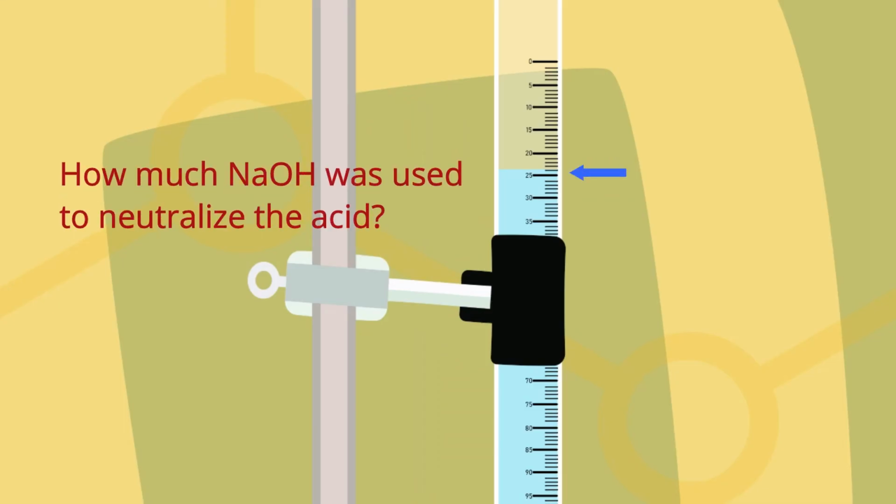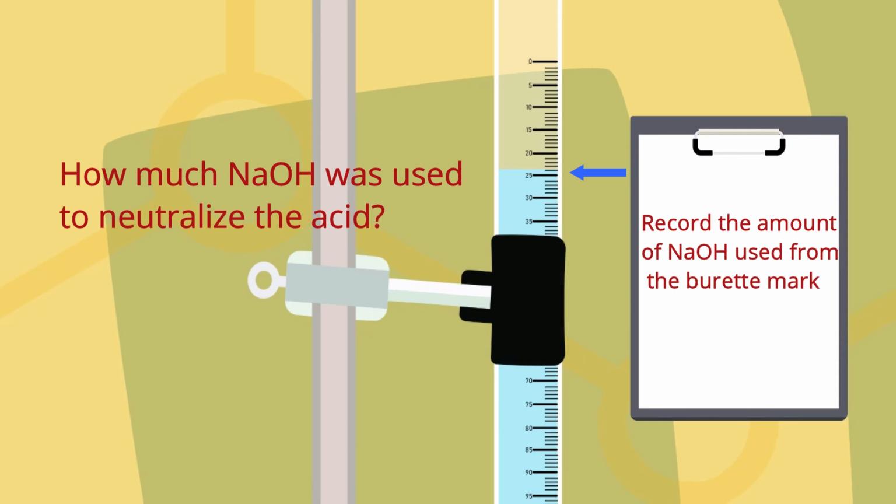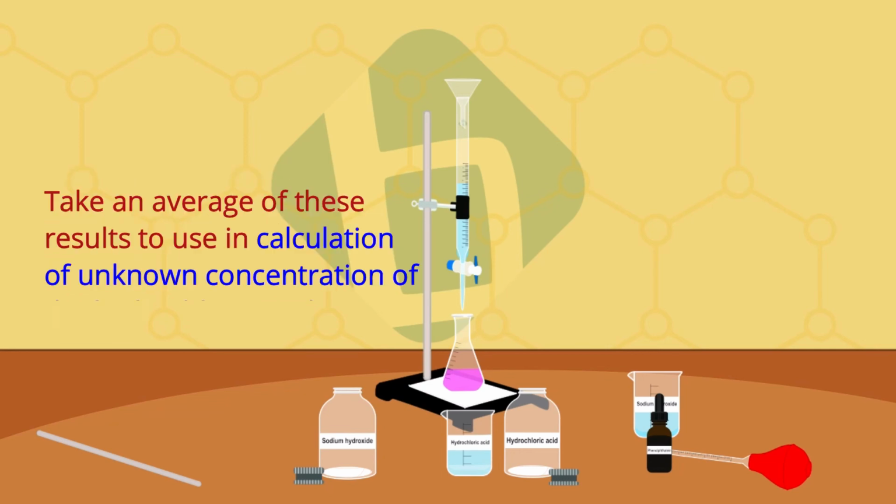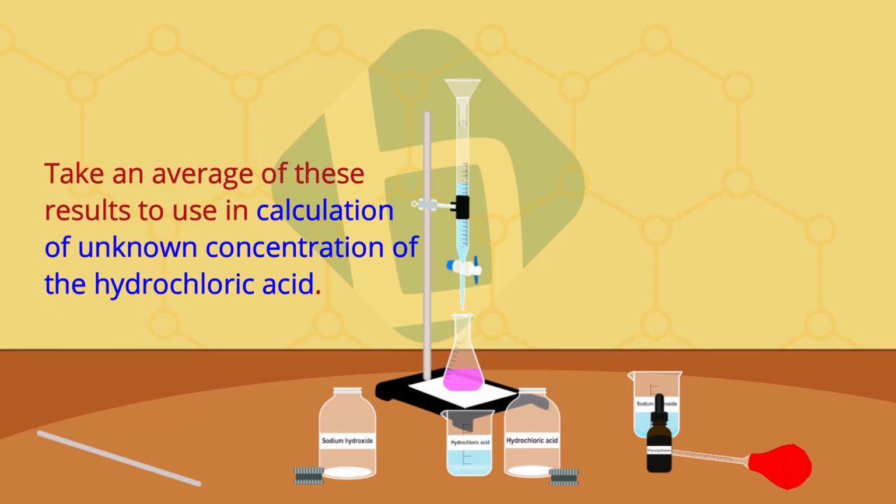How much sodium hydroxide was used to neutralize the acid? Record the amount of sodium hydroxide used from the burette mark. Repeat this experiment at least 3 times to get results within a 0.2 cubic centimeter margin of each other. Take an average of these results to use in calculation of unknown concentration of the hydrochloric acid.